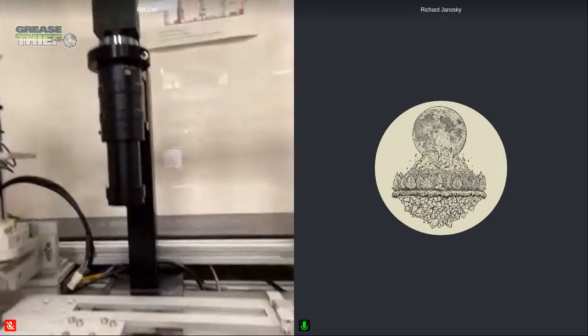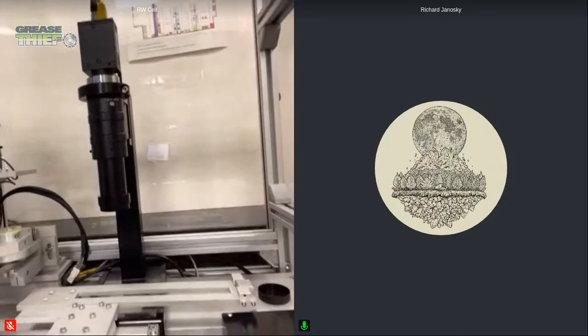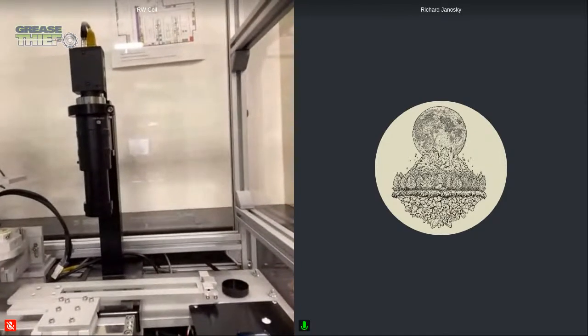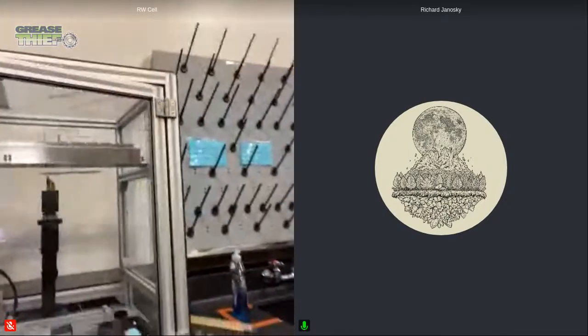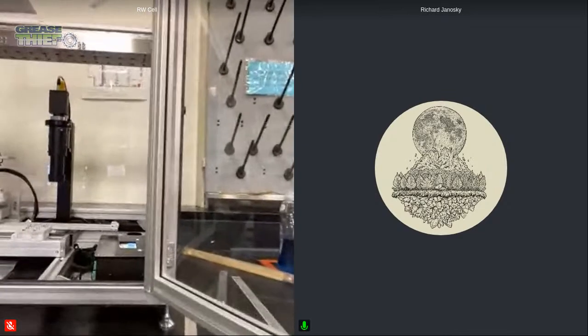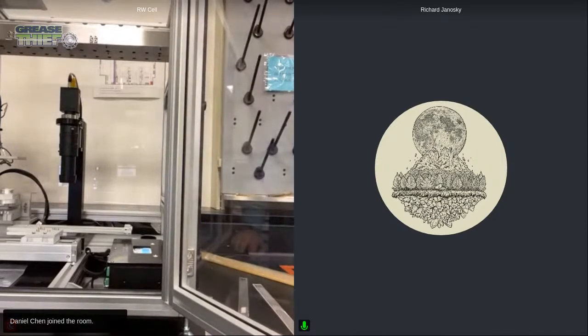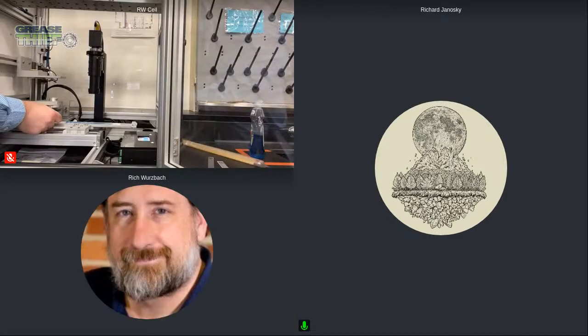And then on the top, you have this camera. It's going to be taking a video, and the light will automatically adjust its pulse width and intensity. We'll review this again later when we're running samples. But that's going to allow us to increase the light to an appropriate point for each sample uniquely, because every sample is not the same color. It'll adjust for each sample so that you don't have to have a set standard level where each sample is different and you might have a problem. This allows it to automatically adjust itself to a sample, and then you're going to be able to perform a really nice particle count on the sample. So I'm going to load our sample up on the tray to particle count.